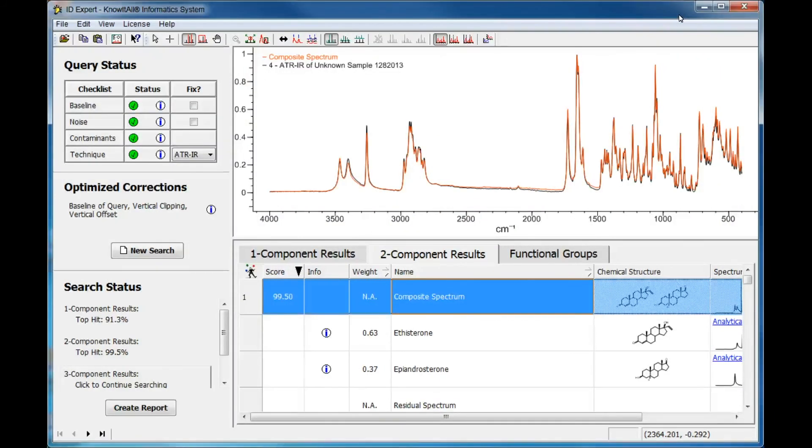If you wish to change any of the settings, change the default search algorithm, toggle optimize corrections on and off, or choose specific databases to search, go to the File menu, choose Settings, and make modifications using the dialog box.